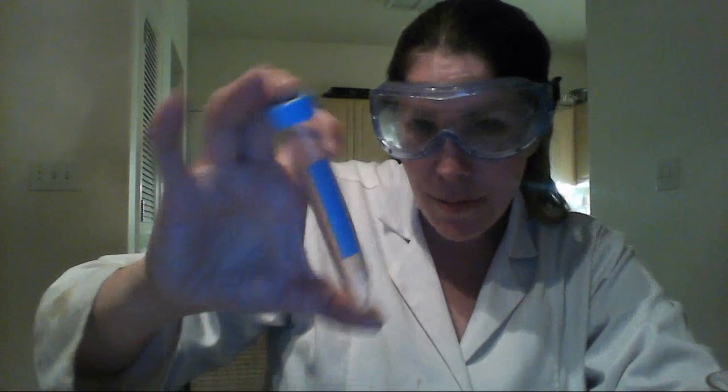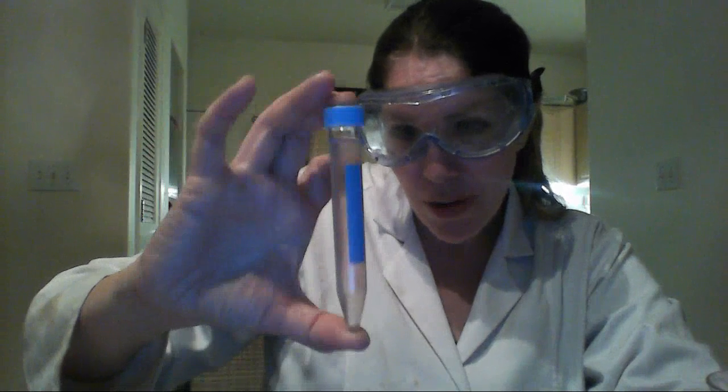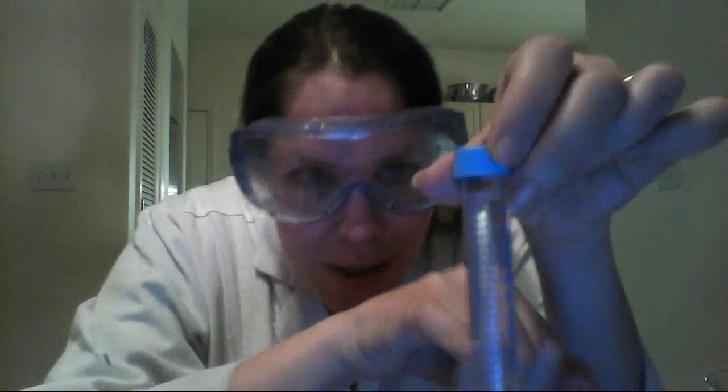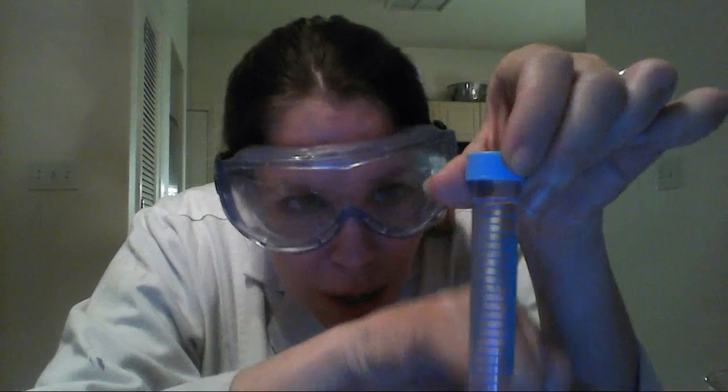1, 2, 3, 4, and I'm going to do it one more time. 5. All right. So that gives, oh, and you start to see little strings moving up and little ribbon-like things. That is your DNA. So now we're going to want to set this.